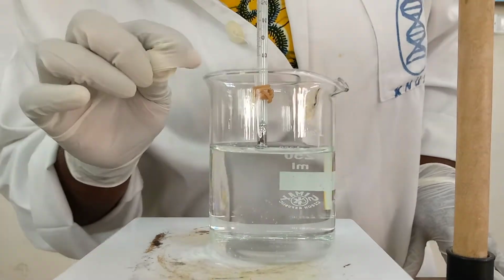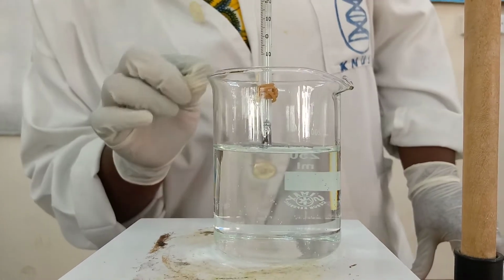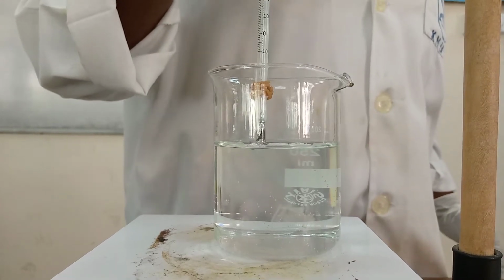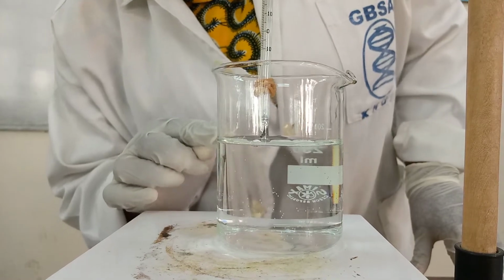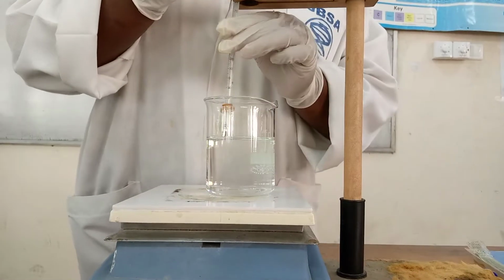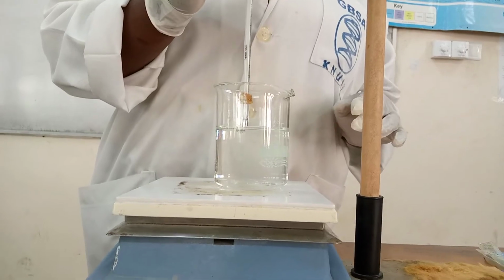So the sample and the bulb of my, let me adjust it well. Okay, so of my thermometer is touching the paraffin oil, so the thermometer is going to record the temperature. Let me turn the calibrations. The calibrations have to face me.